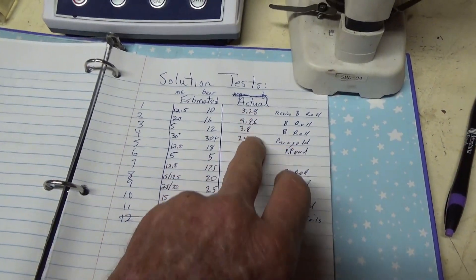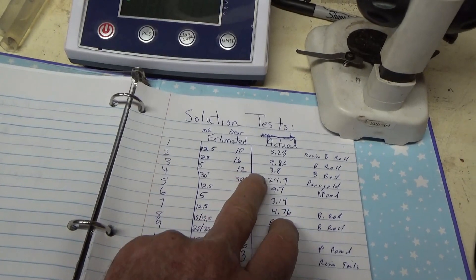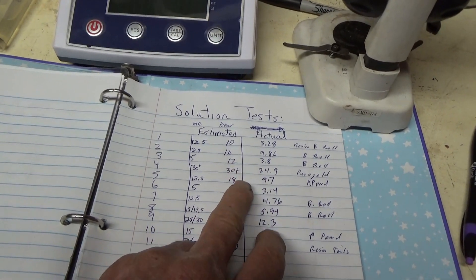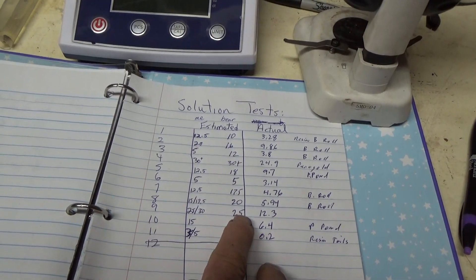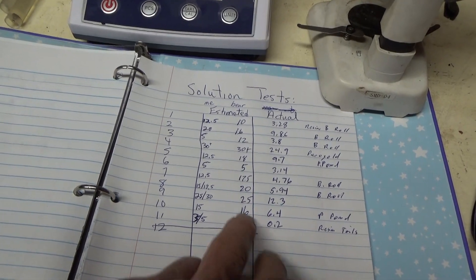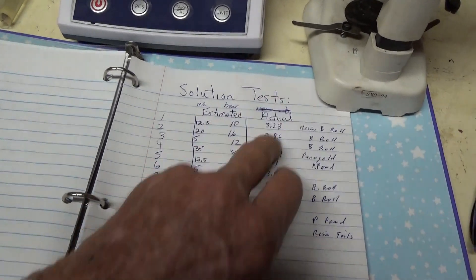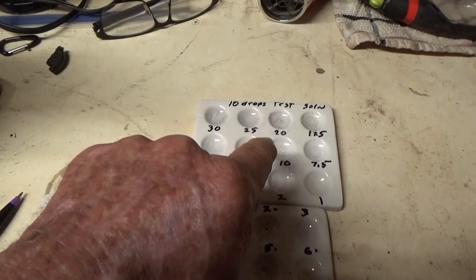If you look at this, in most cases it's two to three times, but sometimes we're estimating it four times higher than the actual. This was dried at air temperature, just left out on the counter overnight. This was forced dry.